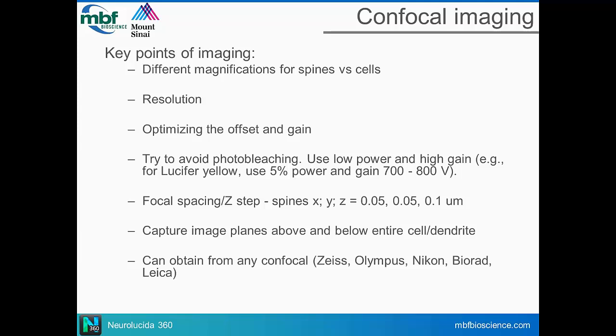So maybe you can set up your microscope using Neurolucida to capture those image stacks for montaging and have it stitch automatically. That setup time may be 10 or 15 minutes, but it acquires overnight, which frees you up to do other things as well.